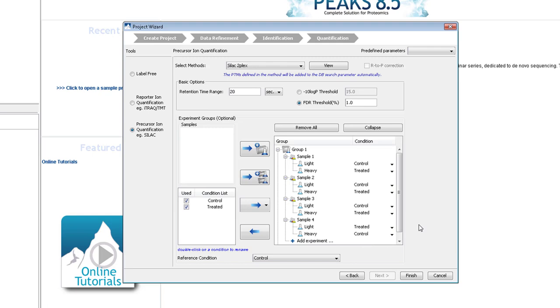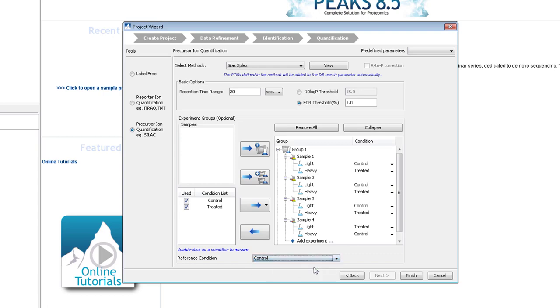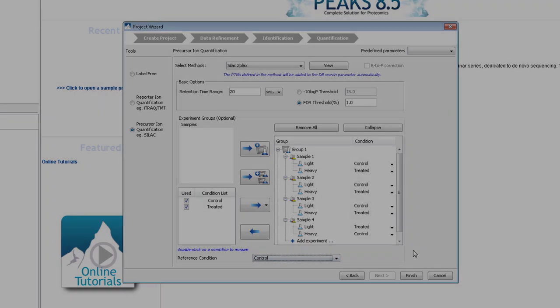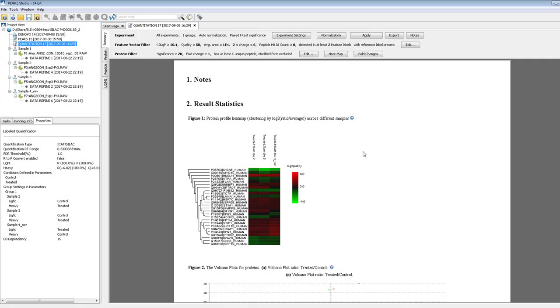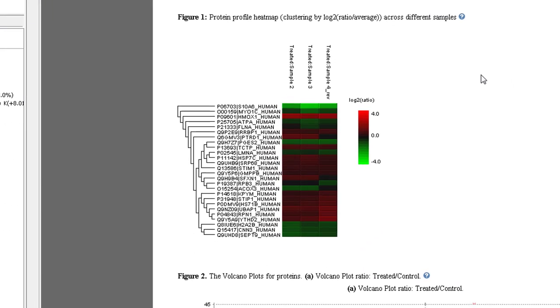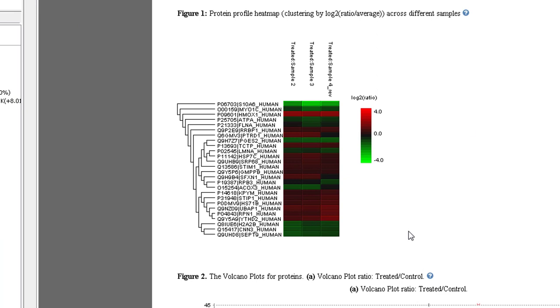The last step is to make sure the reference sample is set accurately. It will be used as the denominator of the protein ratios. Now, we can take a look at the results.